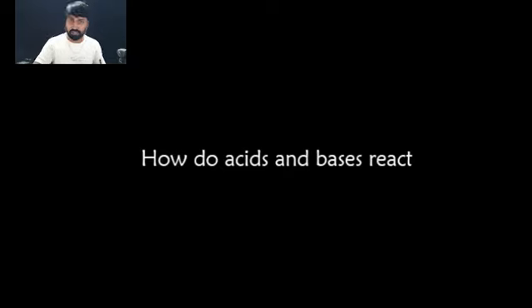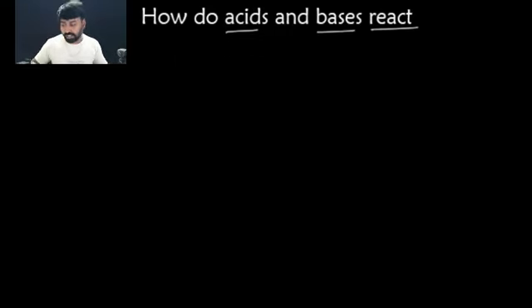I am Rahul, chemistry faculty, and in this video I am going to explain to you how acids and bases react with each other. This is a most important concept. Let's understand this. To make you understand this, I need a test tube, and by that we can understand this.